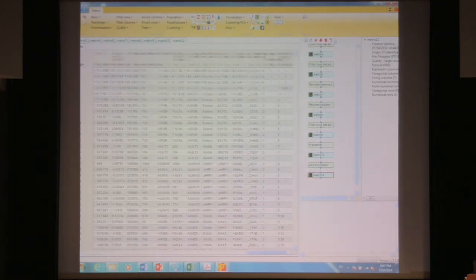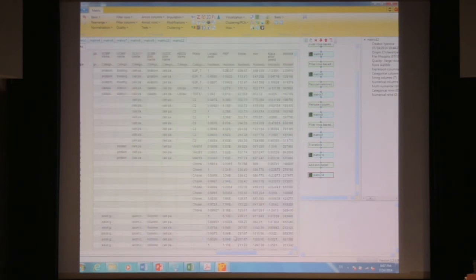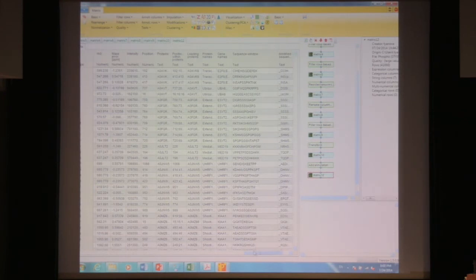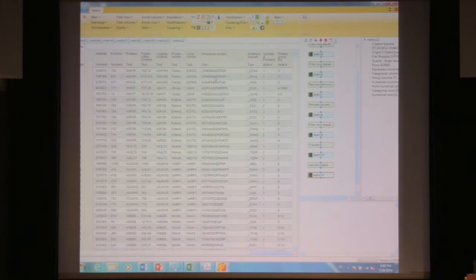which is over here, which you'll find here. So this is the sequence window for that site, and what you'll see is that the central residue is the one that was modified. The surrounding residues are coming from the UniProt sequence database.